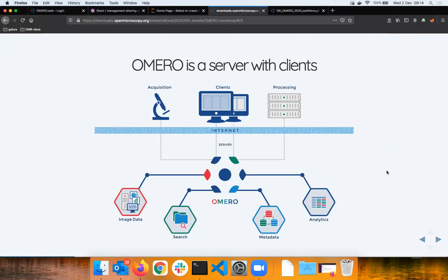So server, you know, this is some complex or powerful machine which is not run by you typically and is not accessible by you. It's somewhere else physically, and it will be probably run by your IT. There will be a specific room. There will be a forest of wire. It's locked for you. It's fine. But obviously, with each thing you want to use, you have to access it somehow.